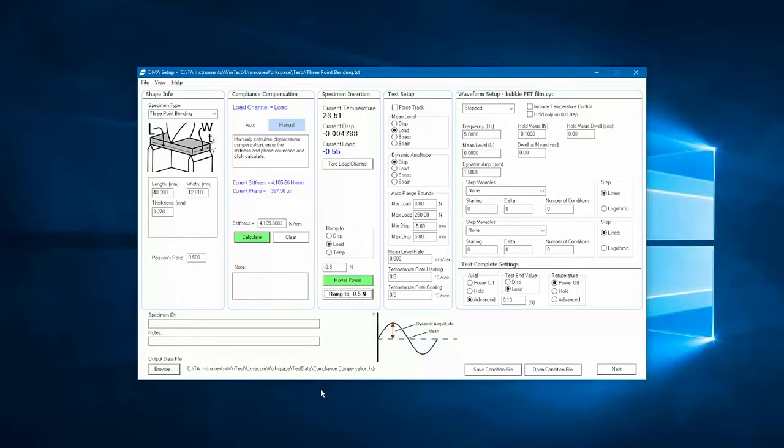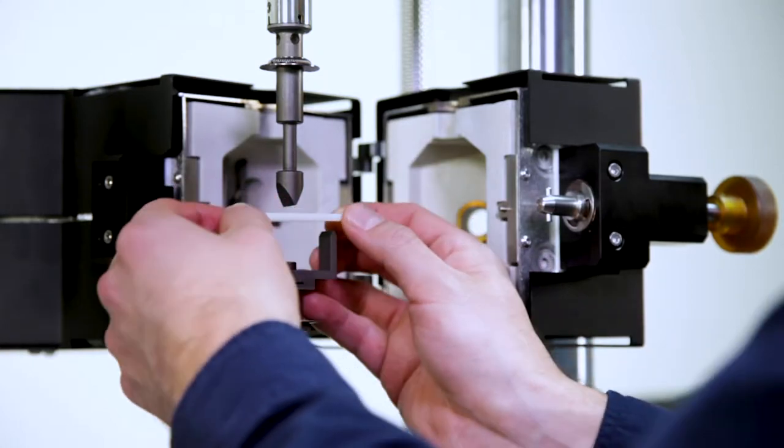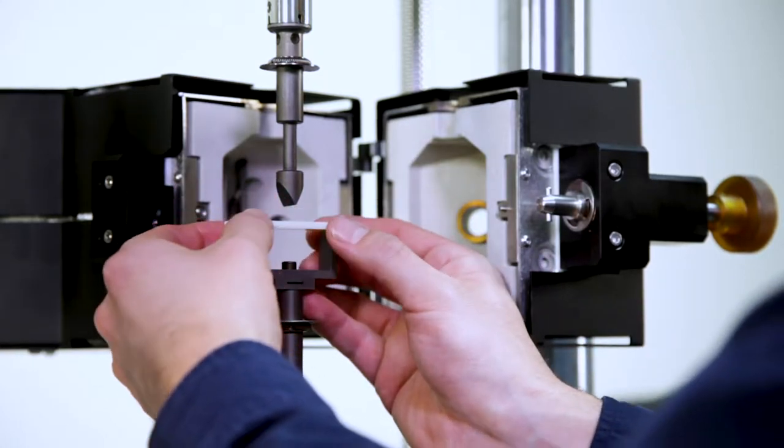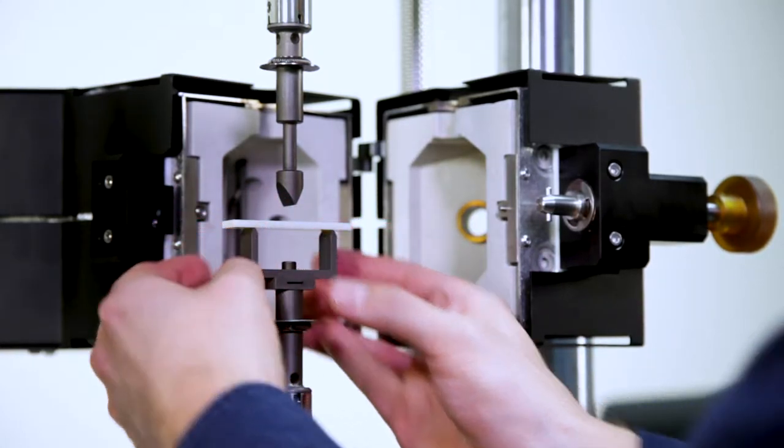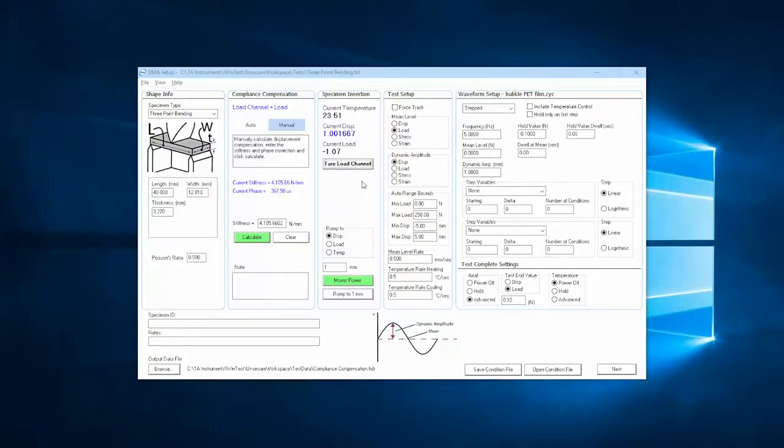Let's go over an example of how to use the specimen insertion utility while setting up a 3-point bend test. After positioning my sample in the lower support points, we tare the load channel to offset the sample's weight.